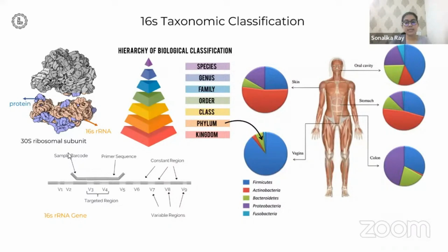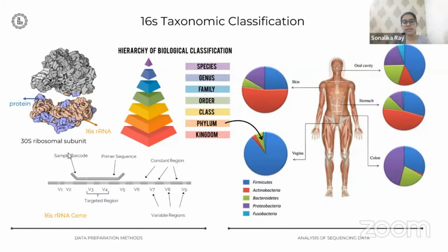Such analysis includes an in-depth understanding of data preparation, reference databases, and analytical approaches to answer specific questions based on solid evidence. Importantly, sequencing data represents only one type of microbial omics, with many more becoming increasingly available.